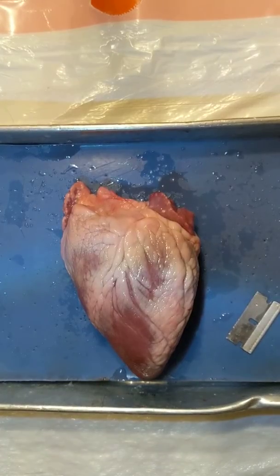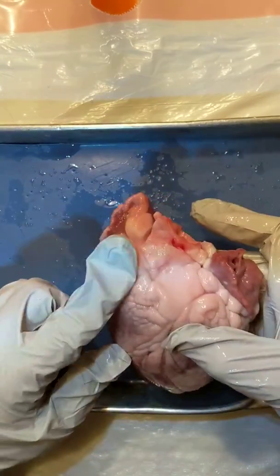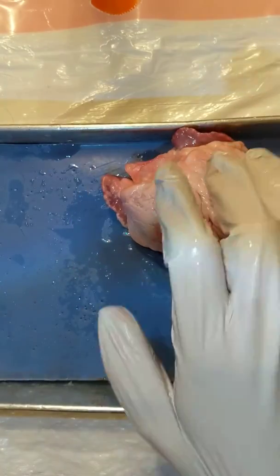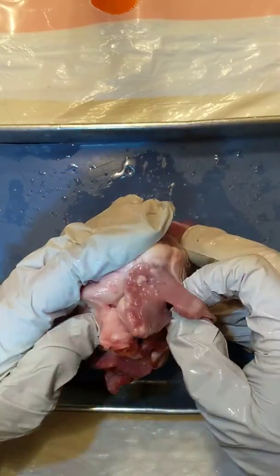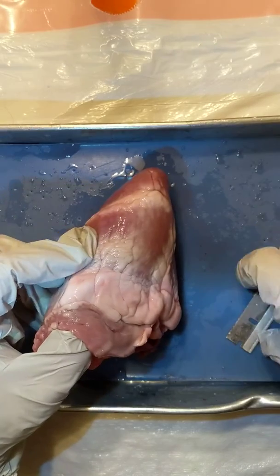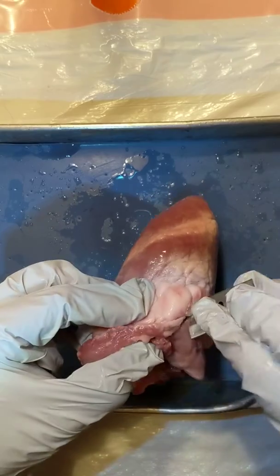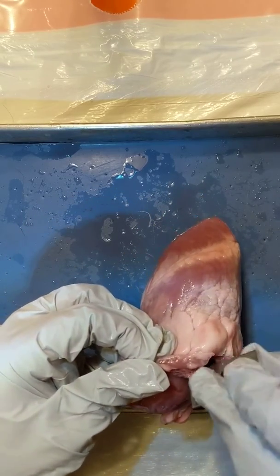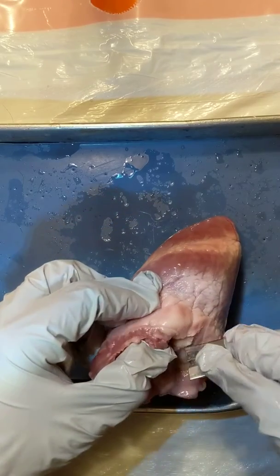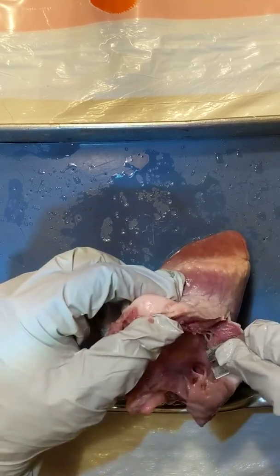Our next step is going to be opening up the right side of the heart — remember this is the sheep's right side. We're not going to chop down the middle; we're actually going to open it up on the side so we can flap it open and look at everything inside. This is definitely easier with a friend helping to hold it in place.